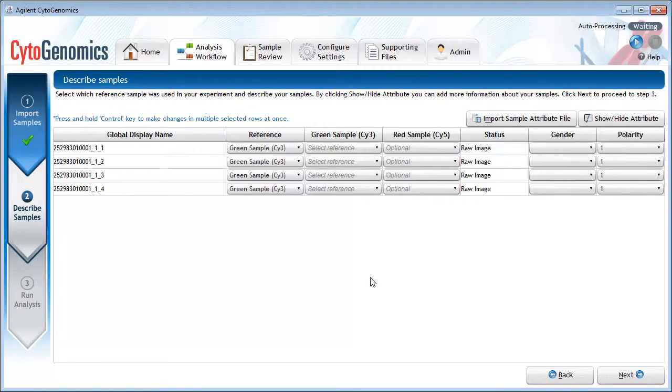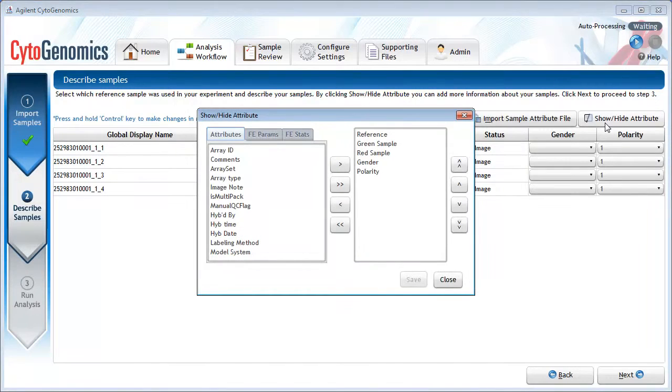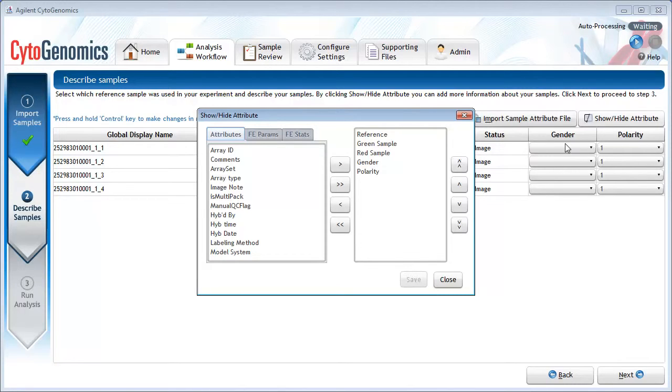To add more attributes to the table here, click Show Hide Attribute. And in the dialog box, move any additional attributes from the box on the left to the box on the right.